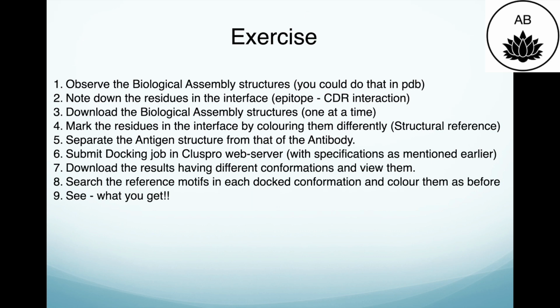Now separate the antigen and antibody structure and submit them for docking in the ClusPro web server with the specifications as mentioned earlier, like masking the non-CDR regions and stuff like that. Download the results having the different conformations and view them. Search the reference motifs in each docked conformation and color them as before. You have to observe whether the docked conformations are actually structurally like the way it is in the reference structure, the biological assembly structure. That's the exercise for you. Repeat it for all the biological assemblies. There are 4 of them.